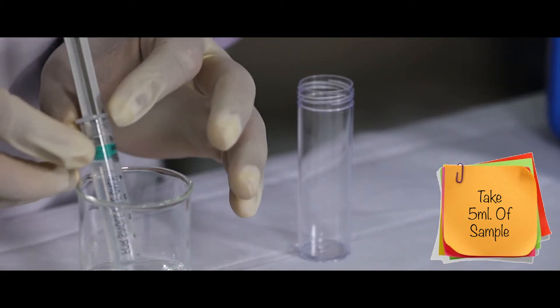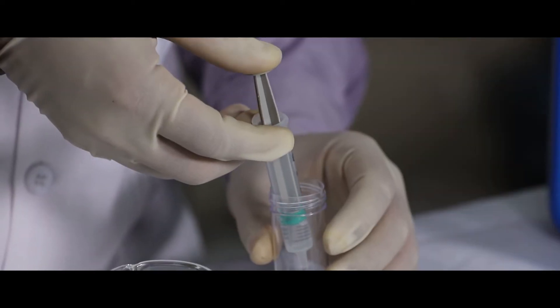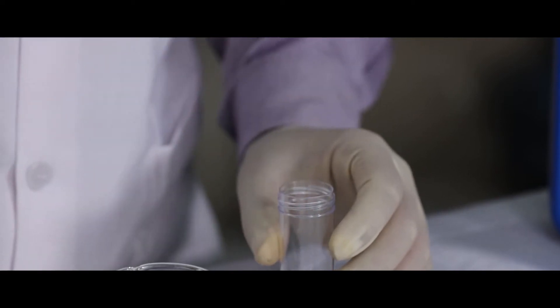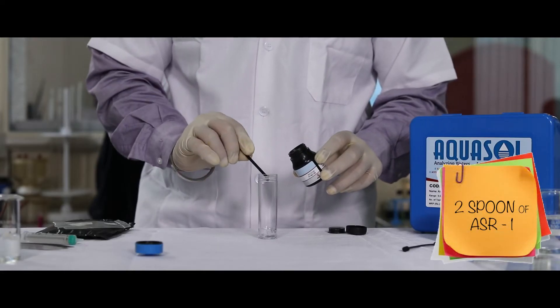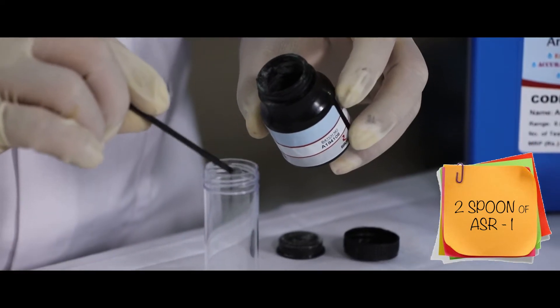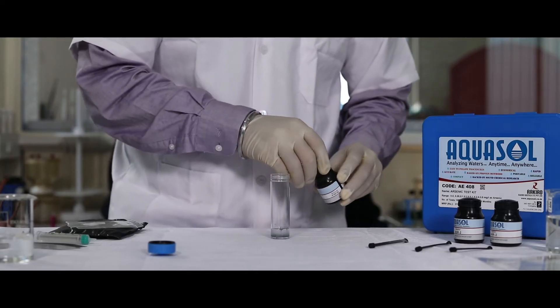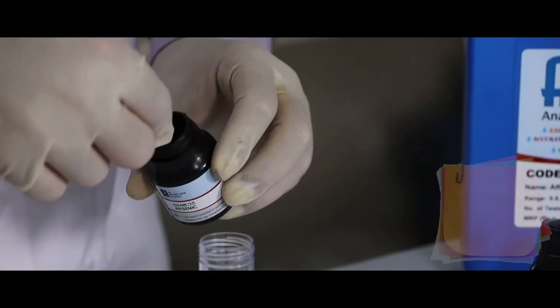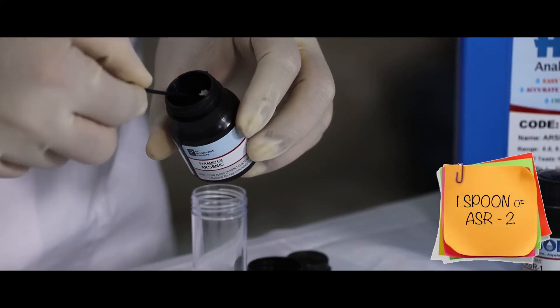Using the syringe, now add two spoonfuls of ASR 1 and one spoonful of ASR 2.